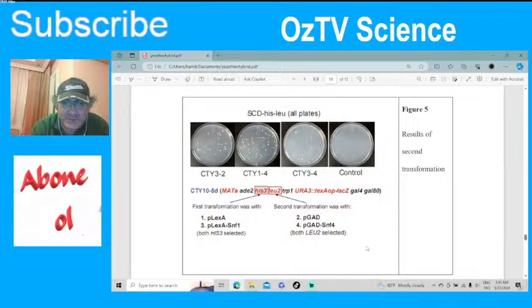the cell with the two plasmids, you have to put them again in synthetic complete media missing histidine and leucine, because now the first plasmid is synthesizing HIS3 and the second plasmid is synthesizing LEU2. To be able to understand that they are actually in the cell, you have to have this plate missing histidine and leucine. That is just to keep the plasmid, and that has nothing to do with the gene activation. So this is just so the cells keep the plasmid.